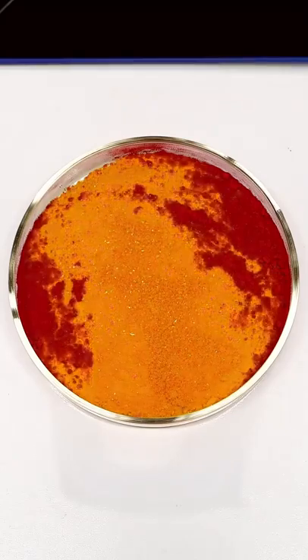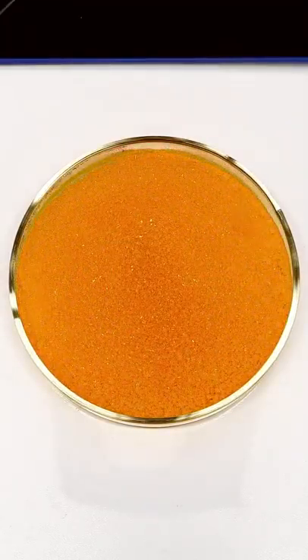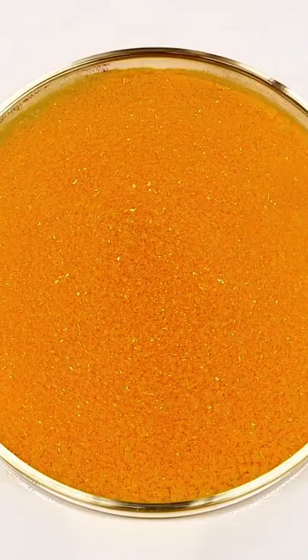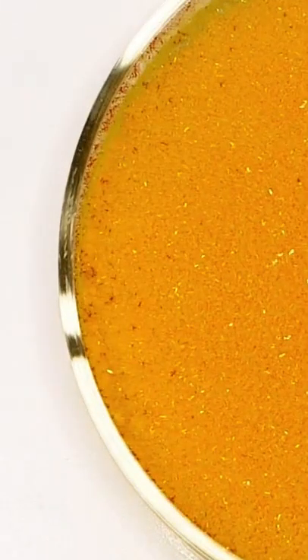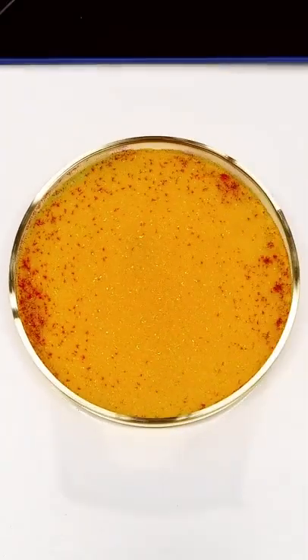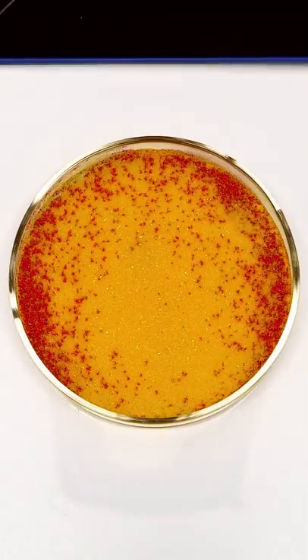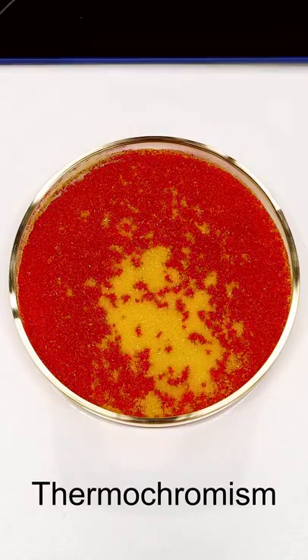It ended up taking a lot longer than I thought, but I was eventually left with a completely yellow powder. What I think is cool, though, is what happens when I turn off the hot plate. Some of the red color starts coming back, and this is happening because the powder's cooling down. This color-changing effect, based on temperature, is called thermochromism, and I really think it almost looks like magic.